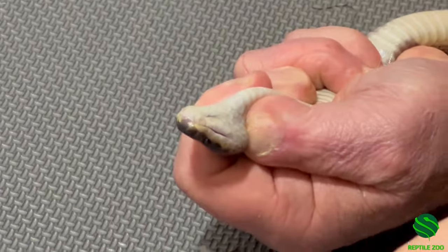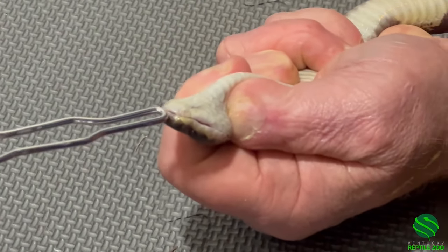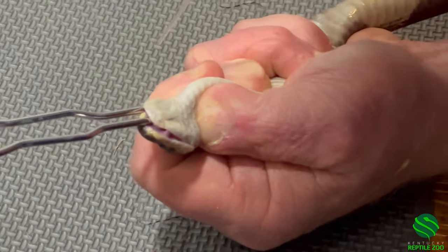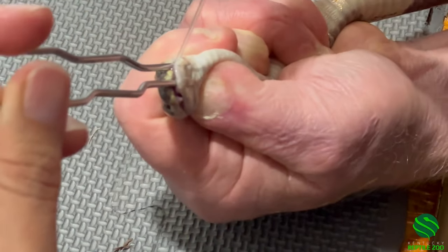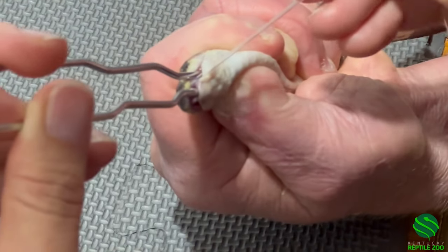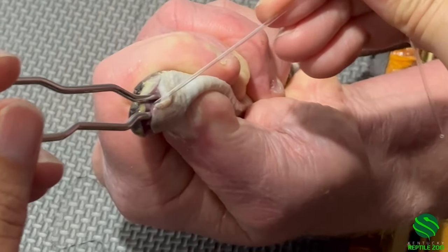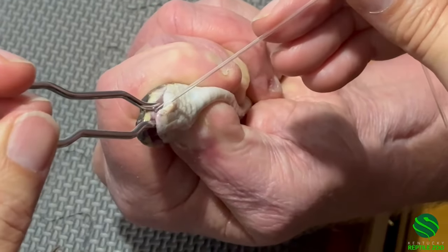I need the speculum. I'm going to try to put it just in the front. It's not wasted — there it is. It's been wasted. It's biting down so hard, the thing is right behind it.